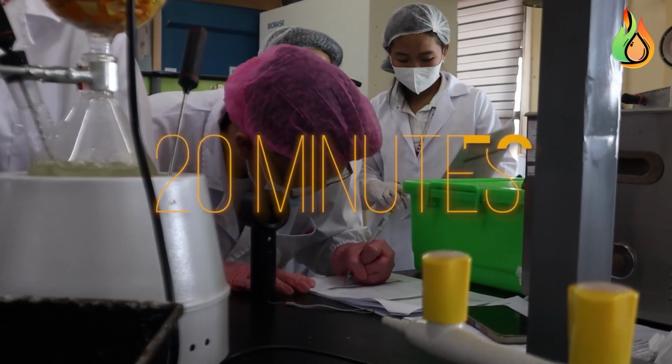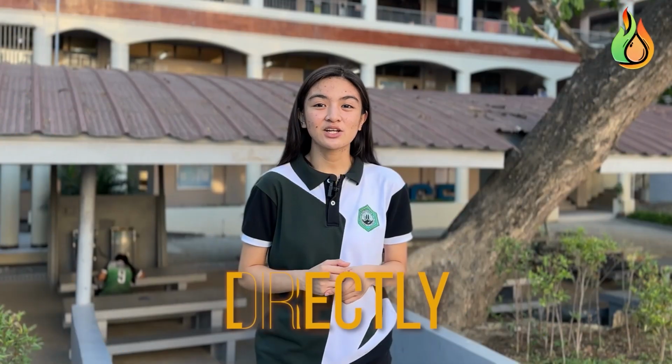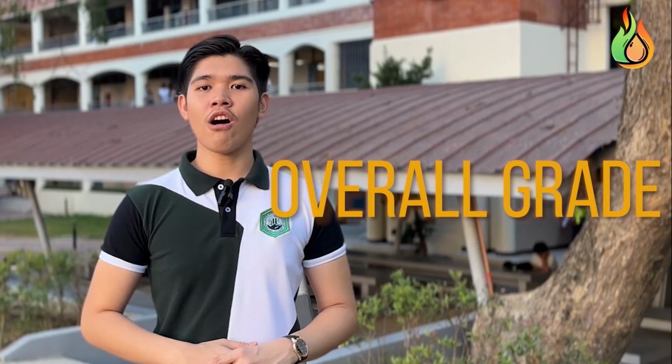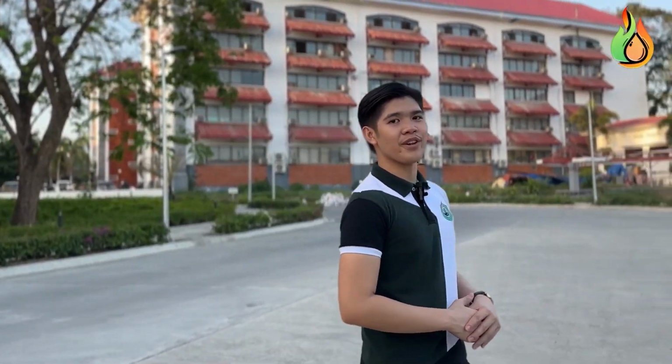The most crucial step is conducting regular observations every 20 minutes throughout the 3-hour experiment, as it directly impacts the yield of the extracted oil. After careful monitoring, the next step is quality evaluation of the extracted oil, assessing purity, composition, and overall grade through precise testing methods. But let's say we extracted a significant amount of oil.